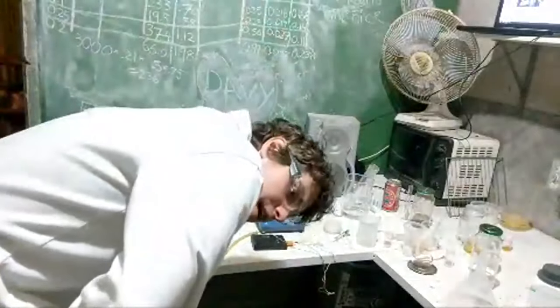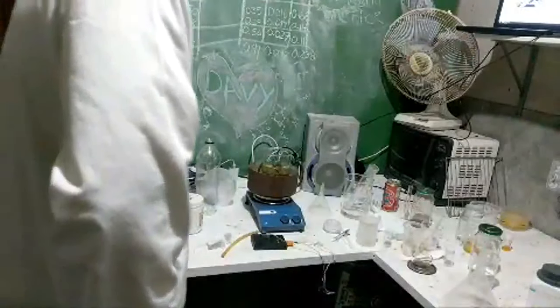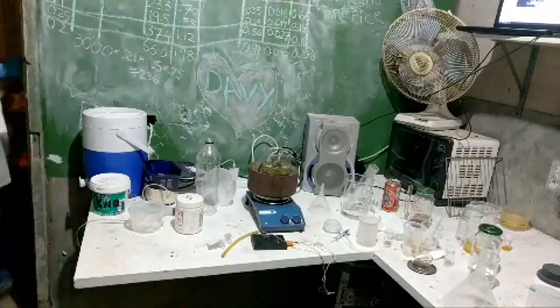Add the iron hydroxide to water first and then add a small amount of sodium hydroxide to get the conversion of hydroxide kickstarted. Why do I need to kickstart the hydroxide? Maybe if I... Do you think it's just going to be slow? Otherwise it's going to be quite slow. Yep, alright, you're not wrong. I'm not wrong. Why are we cooling that down then? Alright. We'll let that go and I'll get another beaker.